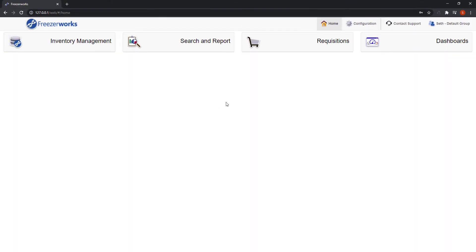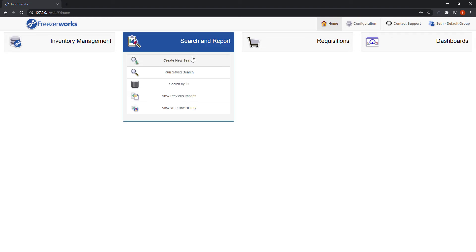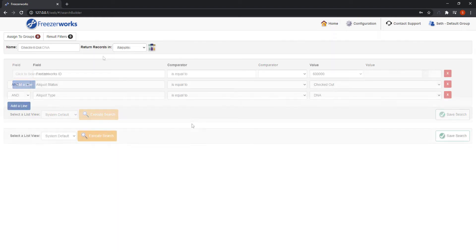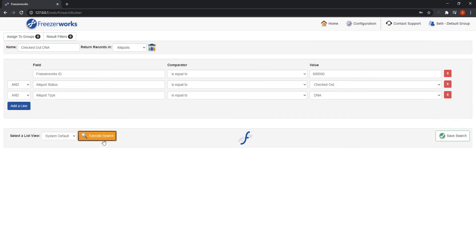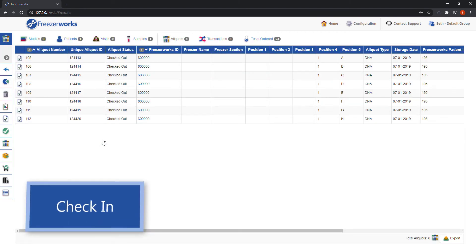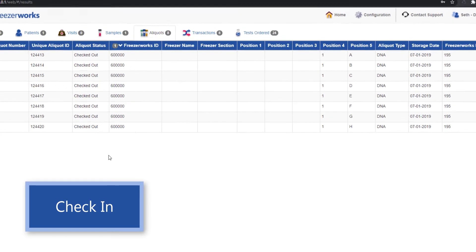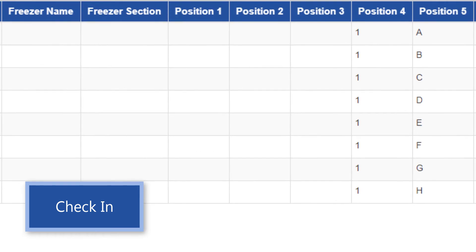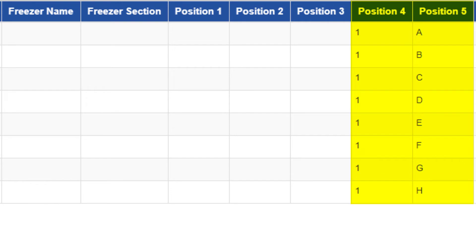To start, I'm going to find those aliquots I checked out last time, because now I want to check them back into a freezer. I'll run a search, and here are my checked out aliquots. Take a look at them for a second, and you'll see that their freezer fields are all empty, except for the last two subdivisions. This is because I selected remove from freezer, but retain aliquot position during my checkout workflow.